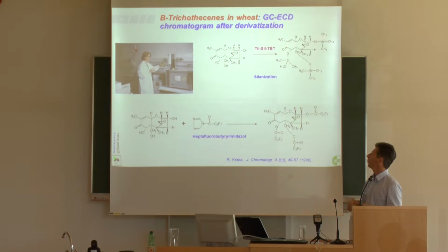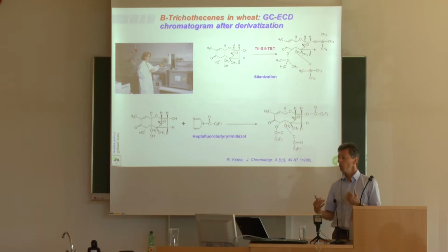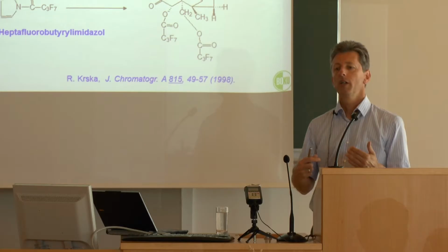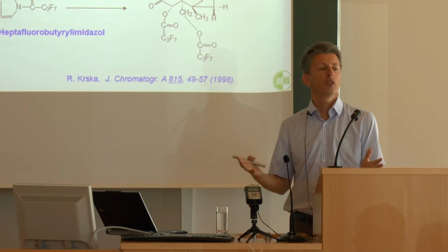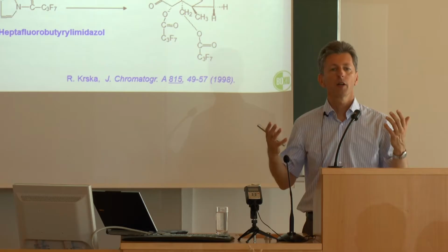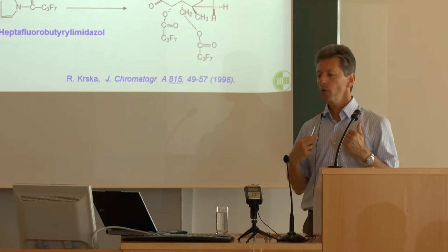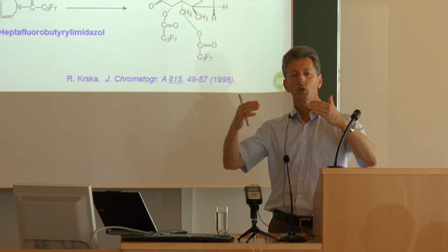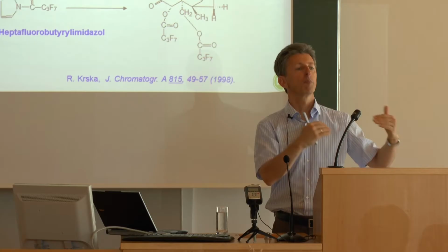But just from a chemical point of view, to demonstrate to you what actually is needed in order to be able to detect and quantify mycotoxins, especially polar ones such as nivalenol or deoxynivalenol. Well, the prerequisite for any gas chromatographic technique is that your substance has to be volatile enough to evaporate. Does deoxynivalenol evaporate quickly? No, it's too polar for that. So in order to evaporate it, you need high temperatures, but another prerequisite of gas chromatographic determination is not only evaporation, but also that this compound evaporates at a temperature where it is not decomposing, right? Because you want to have the entire active molecule.